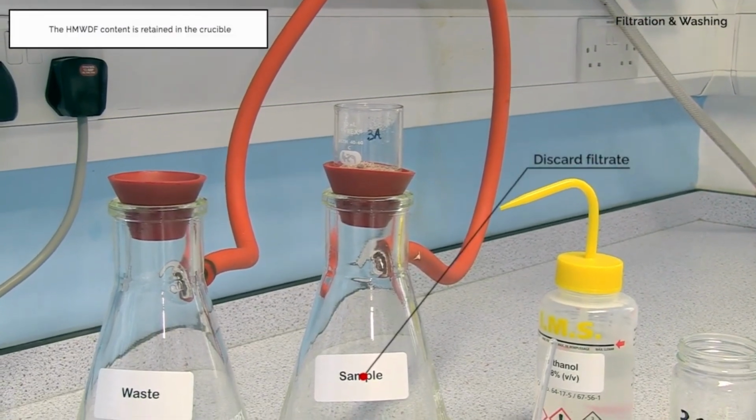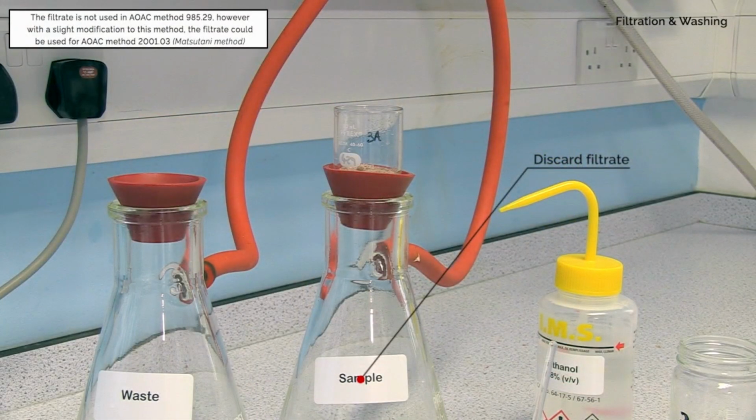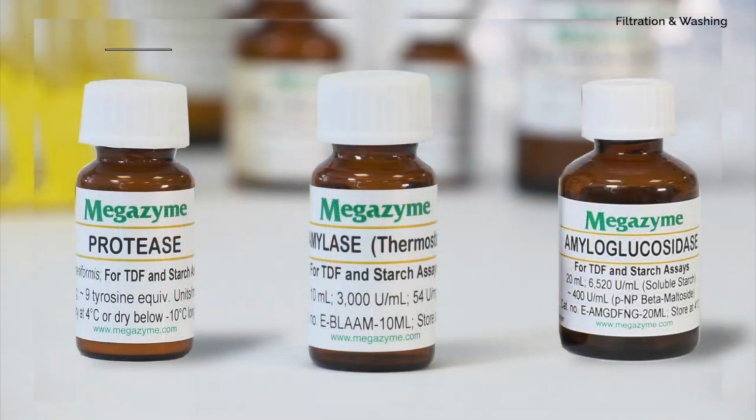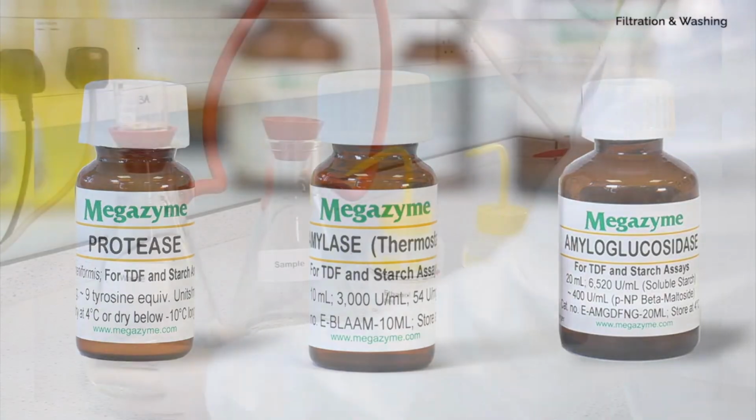The high molecular weight dietary fiber content is retained in the crucible. This filtrate is not used in AOAC Method 985.29. However, with a slight modification to this method, the filtrate at this point could be concentrated, desalted and analysed by HPLC for resistant maltodextrins and other SDFS for AOAC Method 2001.03, the Matsutani method. To be able to perform this analysis, the enzymes employed must be free of glycerol, as glycerol is used as an internal standard in AOAC Method 2001.03.